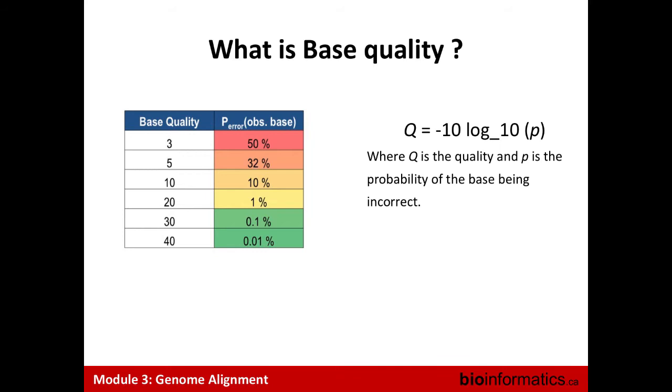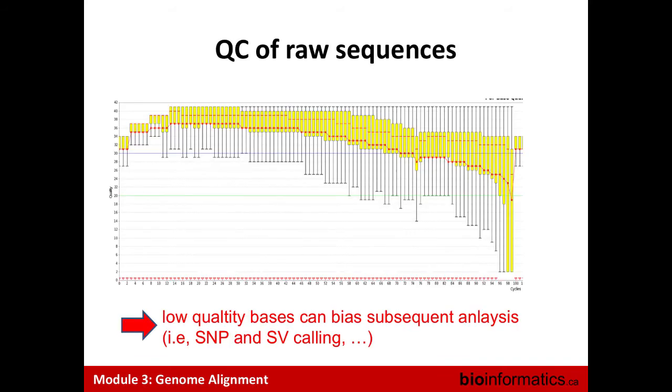So from the FastQ, the best thing to do is to do QC of your data. Another message you need to remember from my talk is metrics, metrics, metrics. Looking at QC is really important to understand your data and to assess its quality. One of the first QCs you can do on your FastQ is based on this base quality, which is to generate this kind of graph.